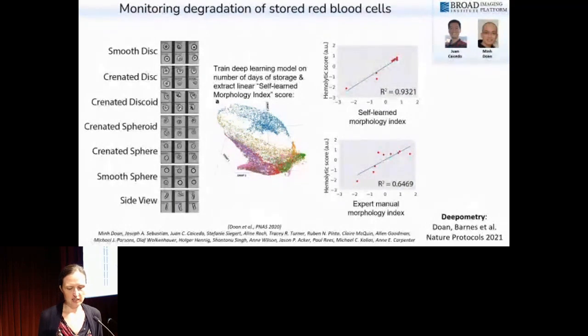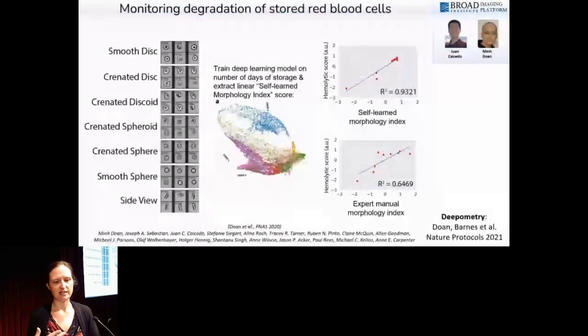So we're really excited here. There's a particular toolbox that makes this kind of experiment easier to carry out, but really excited in general. I think the general principle here is it's wonderful if you can find something biological to train on that is not humans, so that we're not relying on the biologist's perception of what might matter.